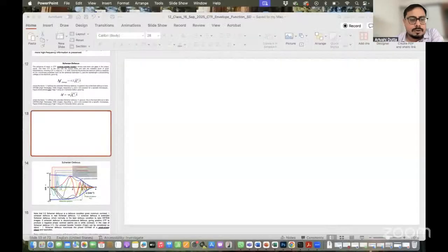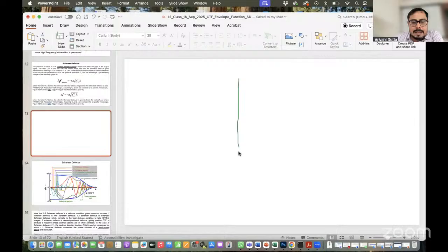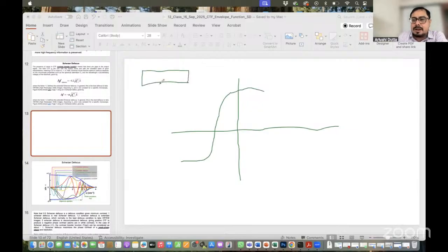That will be easier. Okay, you can see my PPT, right? So in that PPT, if you recall what I did previously, the curve was like that, and then one way this curve is going like this. So if you just consider that there is a metal bar, iron or nickel or cobalt, there will be a south pole and north pole, right? And we are always using the ferromagnet, soft iron, for making those kinds of lens system.